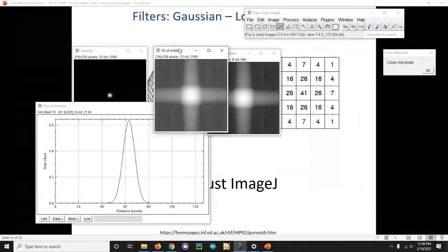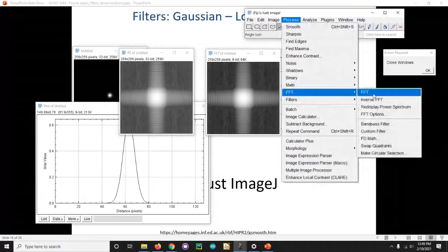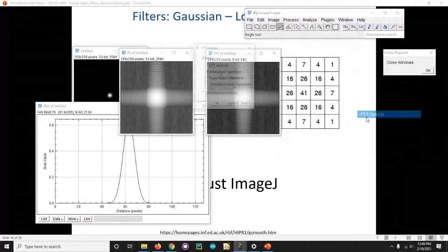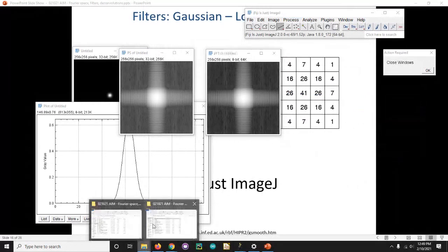And there you go. Hey, that looks exactly like this. So the key is the default Fourier transform representation in ImageJ is the log of the Fourier transform. If you're like, well, geez, Ben, that's a weird representation, why do we do that?